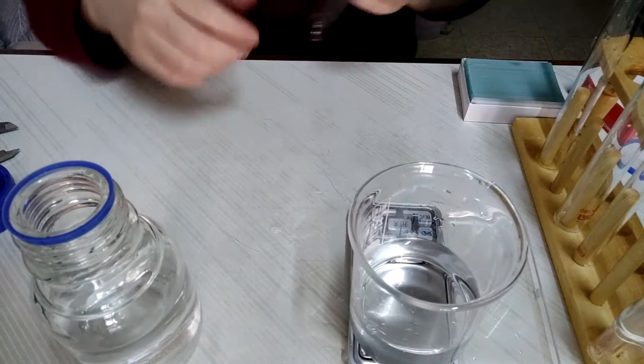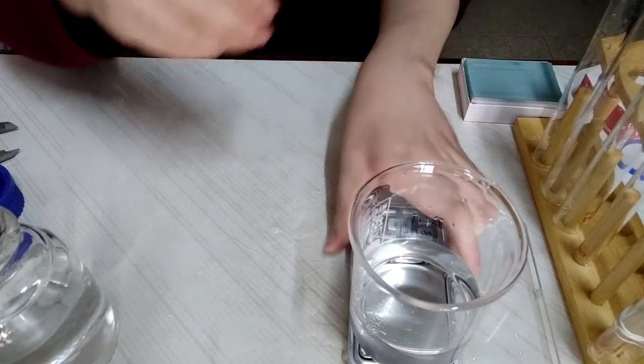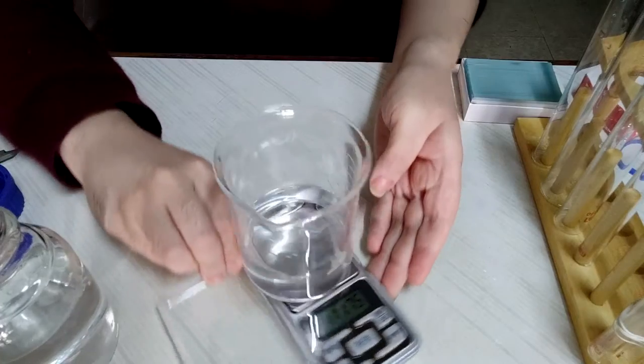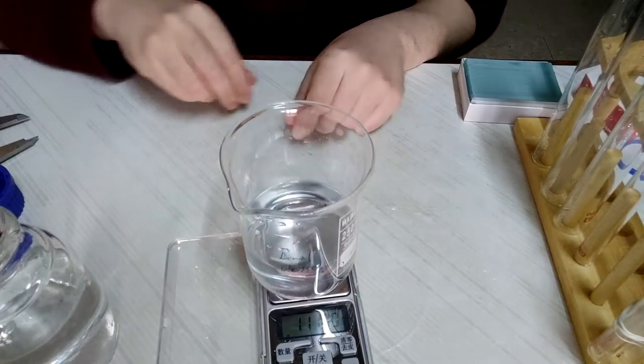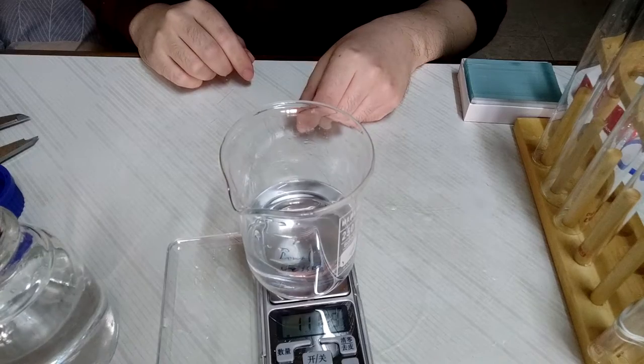And the volume, it's a staggering, slightly more than 100 milliliters.